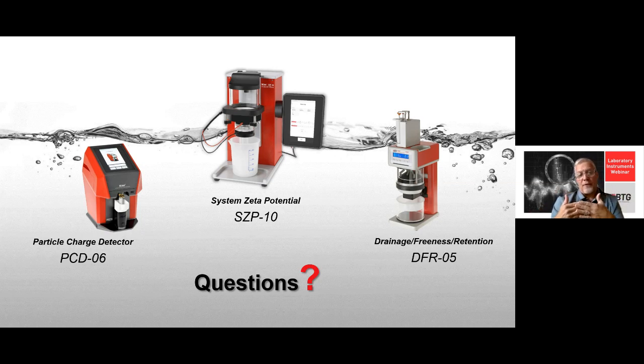Because I think we made the case earlier that the device wants to be clean to run. So, Manfred, is there a protocol for looking at additives and devices for the operation of the machine to do the titrations, and also make sure we have the right amount of titrant and can clean it and use it for other things afterwards?